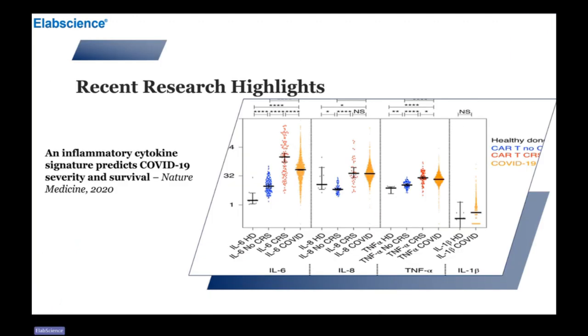Okay, and lastly, some of the recent studies highlighted the evolving role of ELISA in translational research, where ELISA can quantify critical inflammatory markers such as cytokines in COVID-19 patients, revealing immune signatures linked to disease severity. It has also been used to detect several soluble cancer biomarkers, supporting early detection and therapy monitoring. These examples demonstrate ELISA versatility across different disease-related sample types.